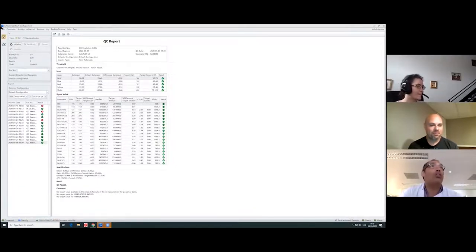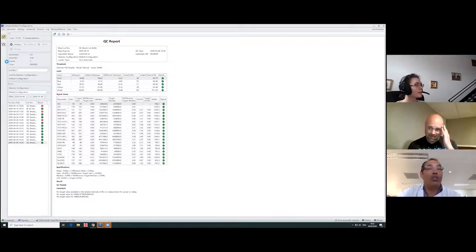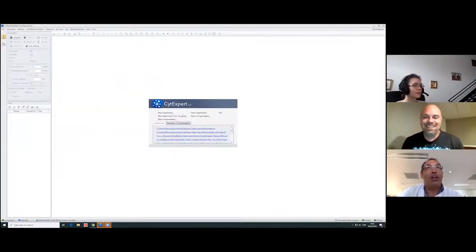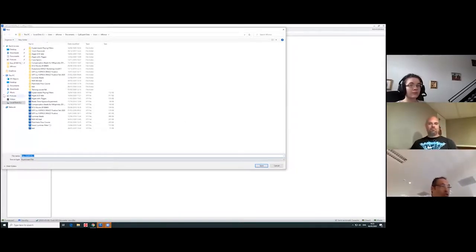Now, what I will do is play a little bit with your brain because this instrument is slightly different. So I will close this QC and open a new experiment. In this case, it's just to show you a few things and a few tools that we will be using. We have been talking about thresholds, and remember, you have to train your own users.